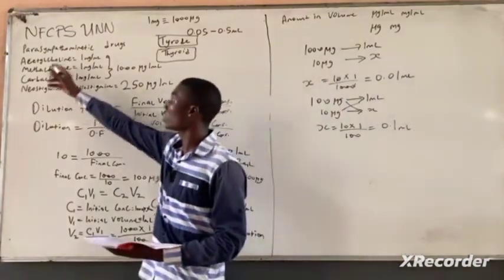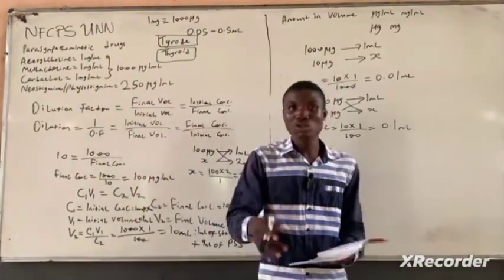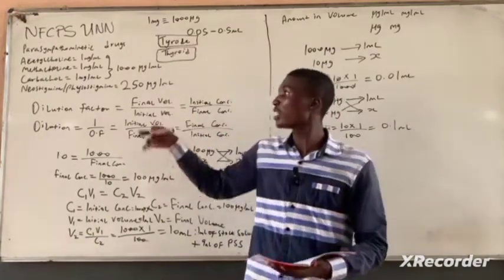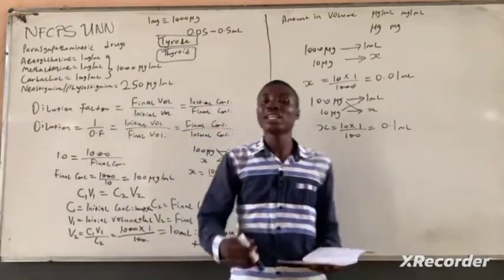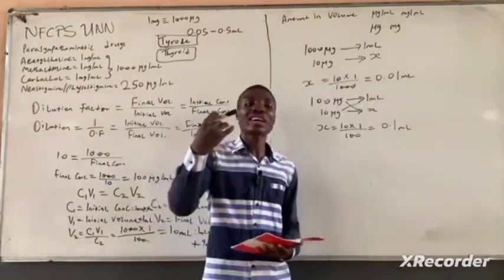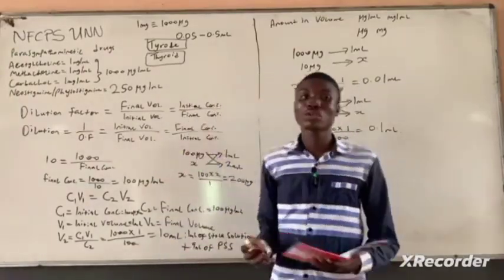Now when you apply acetylcholine to your guinea pig ileum, it's actually going to act on the nicotinic and the muscarinic receptors, so that by implication you are going to be getting your responses because acetylcholine is an agonist. That's a parasympathomimetic drug. Same thing with methacholine and same thing with carbachol. All of them are going to be acting on both the nicotinic and the muscarinic receptors, leading to the kind of results you now have on your kymograph. So the results you get on your kymograph are based on what you've applied.